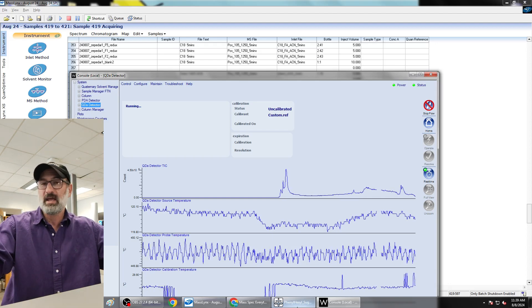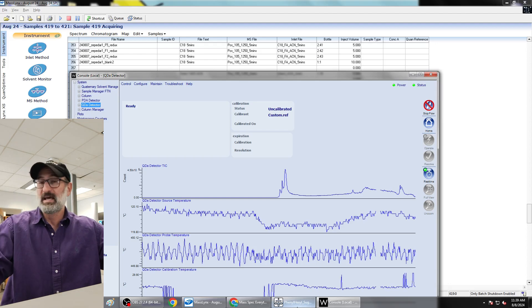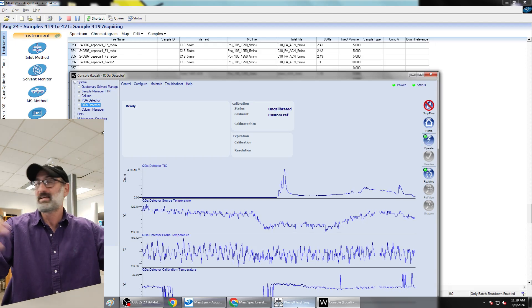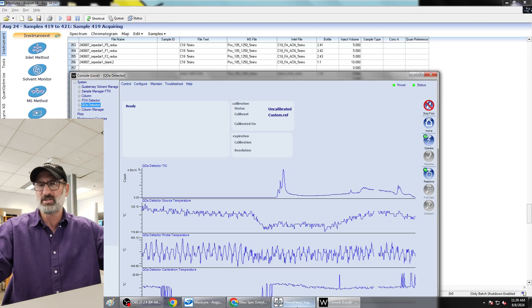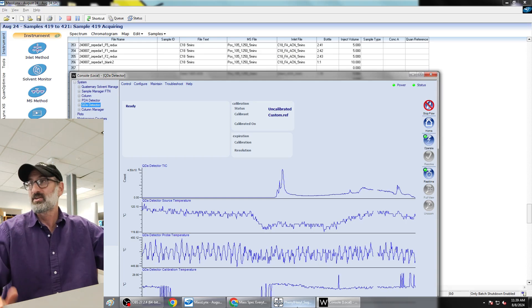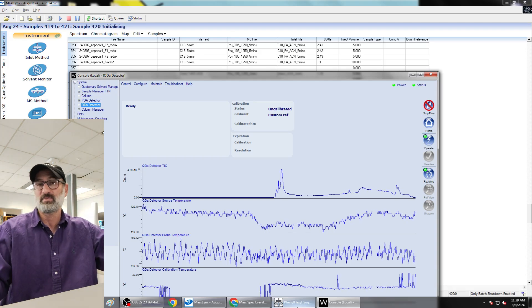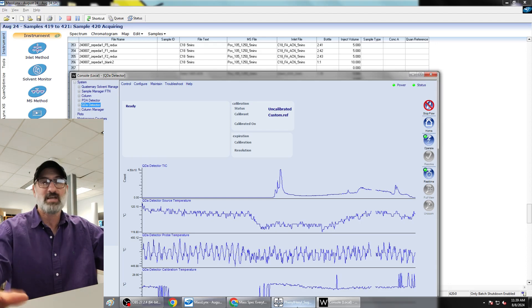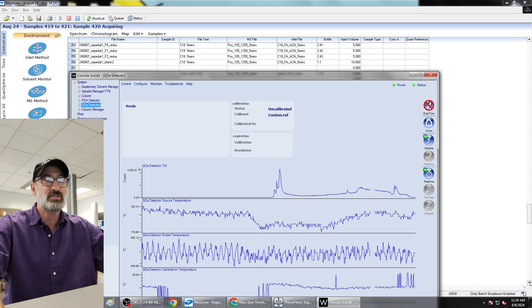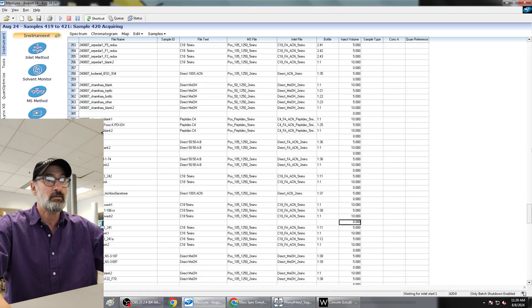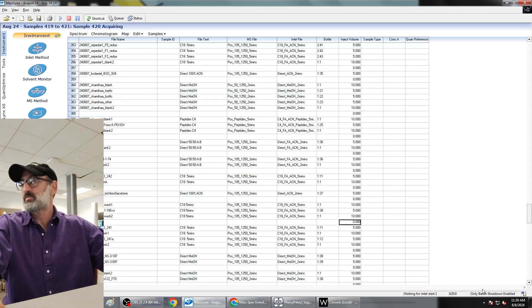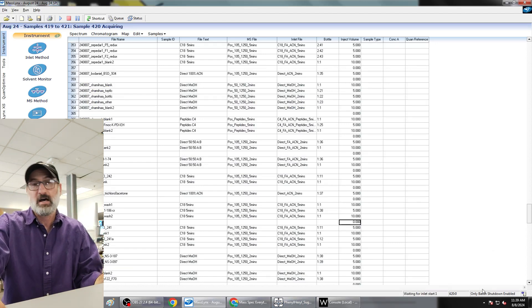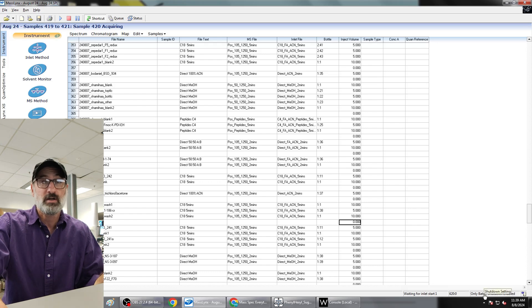But the column managers don't have a waste port dedicated, so you have to dedicate a whole channel just to that and then switch it with a manual. It's impossible. So there's no real valve on this system. So because of that, they do this stop flow thing, which is incredibly annoying. That makes it difficult to turn the instrument on and off properly because you have to do things in the correct order.